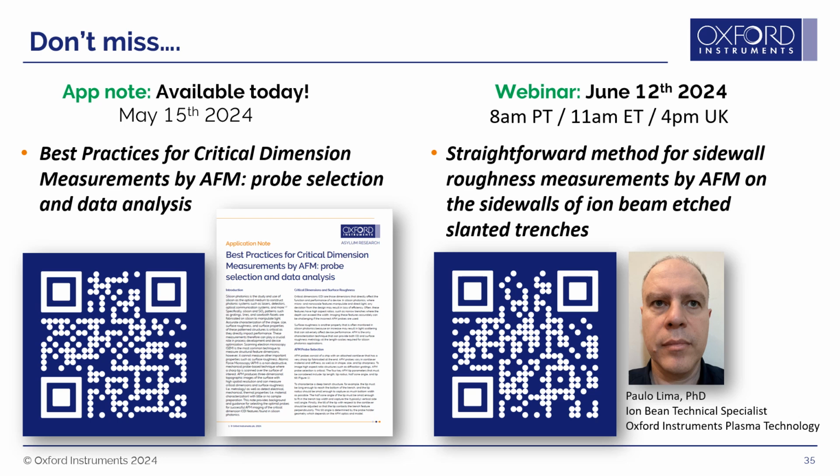I guess sample size, depending on the AFM that you have available. Sample size is one consideration, so you want it to fit in your AFM. Preferably, as for any AFM measurement, you want your samples to be clean.